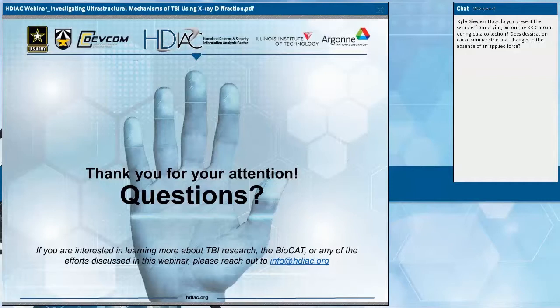Thank you. Yes, I'll be happy to take that. I think as we covered this earlier on, this is prompted from some good insight as to exactly what is occurring. So the answer to this multiple composite question is yes. Desiccation, drying definitely does lead to similar structural changes, which is why we took such great pains to control the experiments in the way that we did, and actually obtain data from dried samples as well. The good thing about the X-ray diffraction is that it's apparent in real time. Looking at the raw data alone, you can tell when a sample is becoming dehydrated. And so once we learnt the circumstances and the timing under which a sample may undergo that, then we learnt the parameters that the experiments needed to be conducted in and made sure that they were done so that that didn't occur.